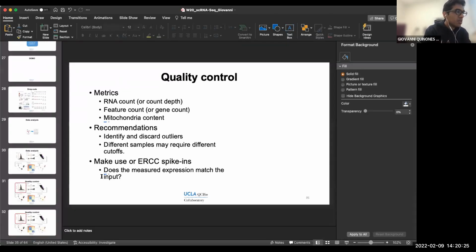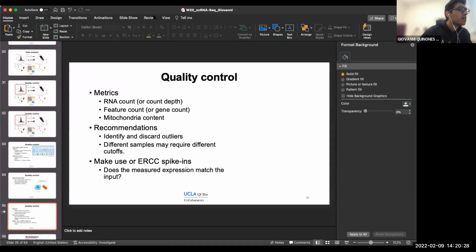So, let's jump back to our code. I think I'm just going to share the entire desktop. It should be easier.